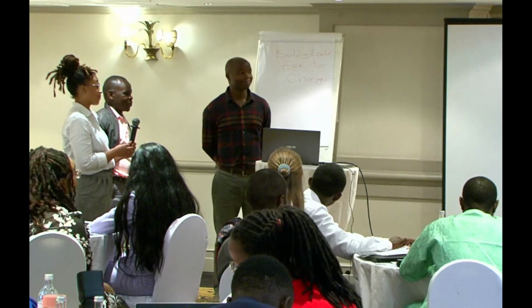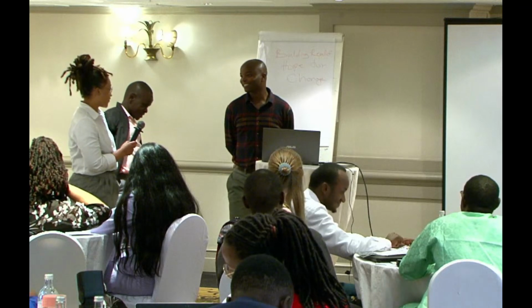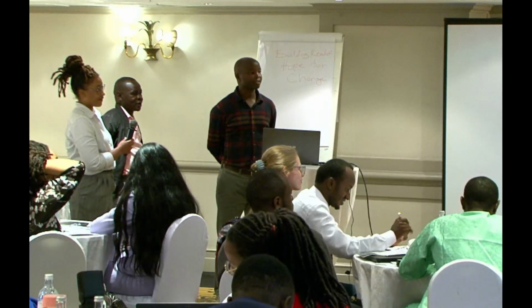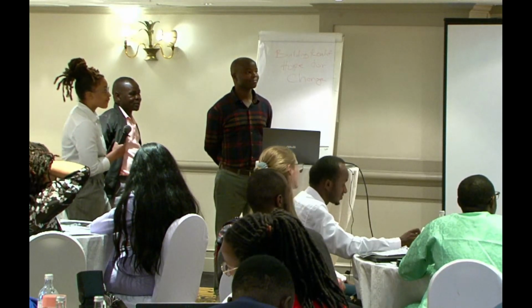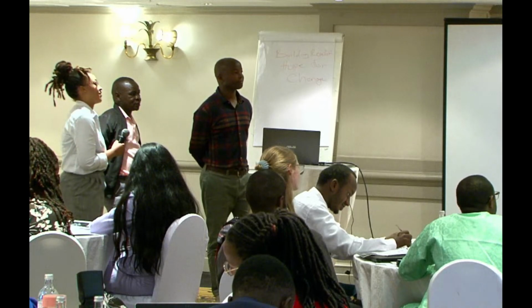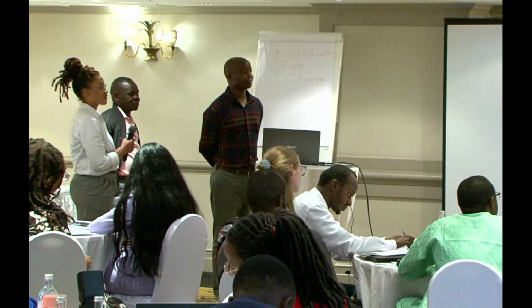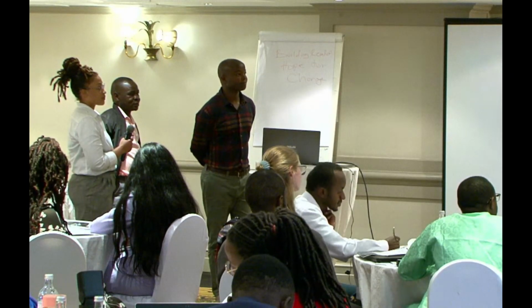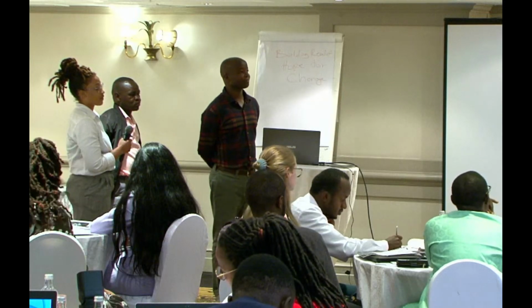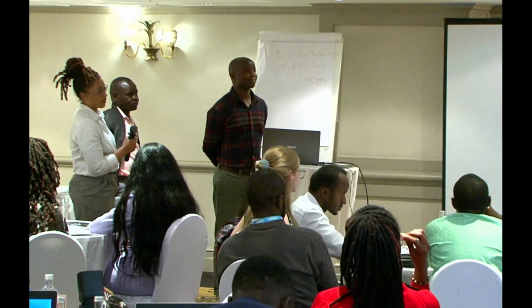Okay, so just write it out. If you don't have the normal visualization in the traditional TLC plate, we normally use sulfuric acid to just do visualization. We spot it and then burn it. And for HPTLC, I can just elaborate it out.